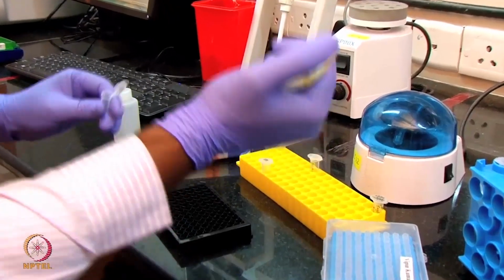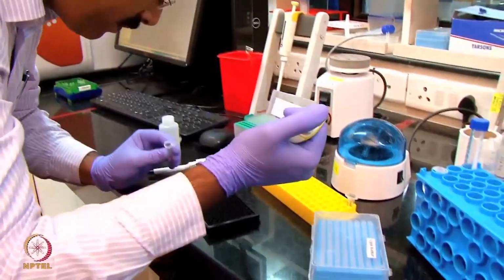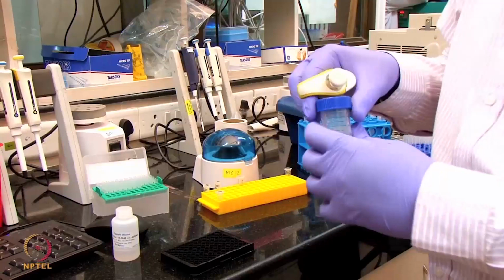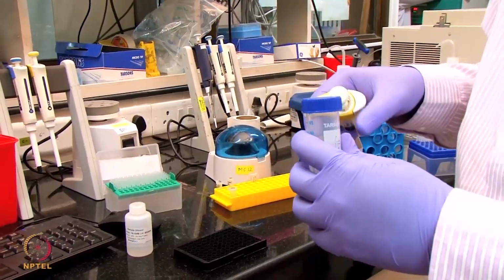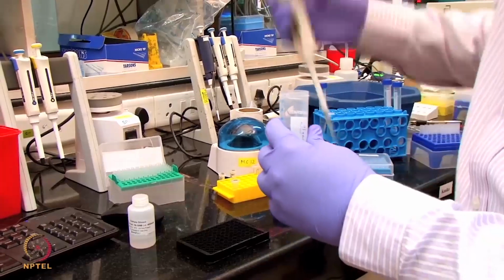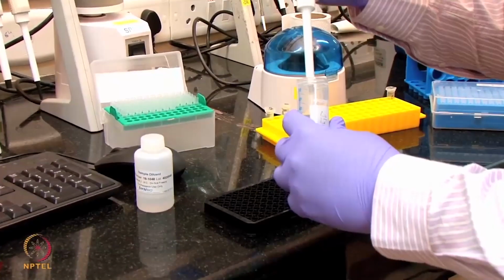Which is sample number 3 at B4 and B5. So there are 3 unknown samples. I'm using the glycine buffer, a pH 2, 10 millimolar glycine buffer. This is used for the regeneration of the sensor. The regeneration buffer I'm going to place at A11 and B11.